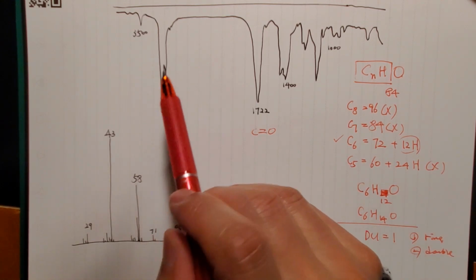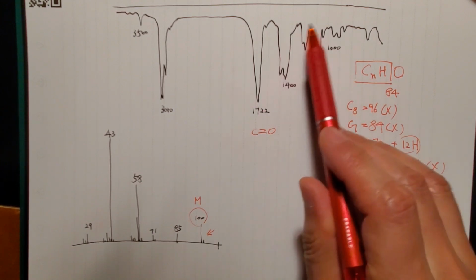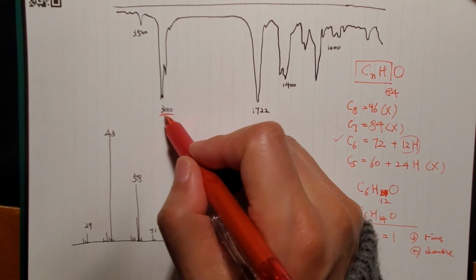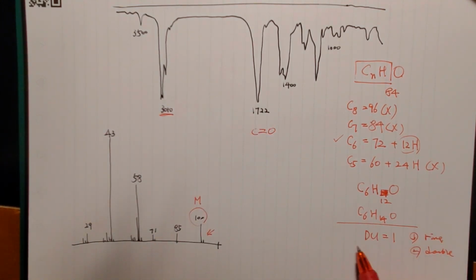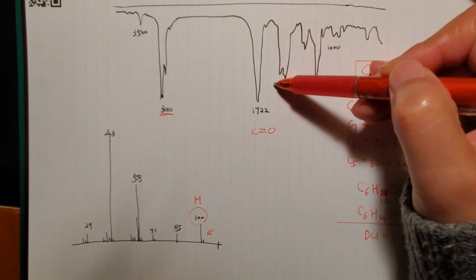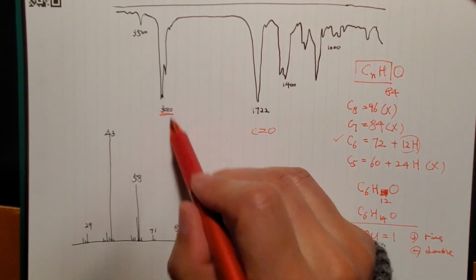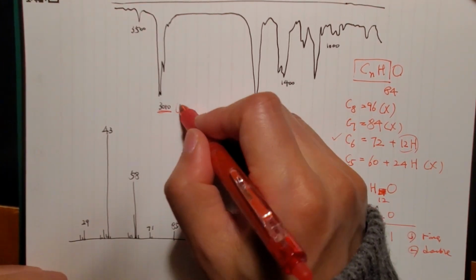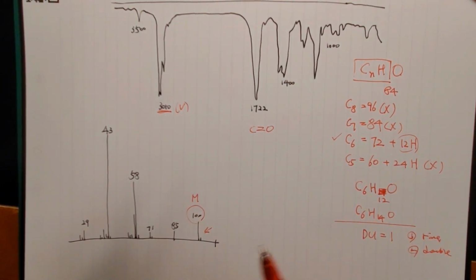And we just see the rest of the CH stretches and bending vibrations. And this number is kind of concerning because it's over 3000. But we're not supposed to have any other double bond, and we lack anything around 1600. So maybe these are not alkene peaks, the CH on the alkene, right? So keeping that in mind, there could be the case that the molecular peak is not really 100.